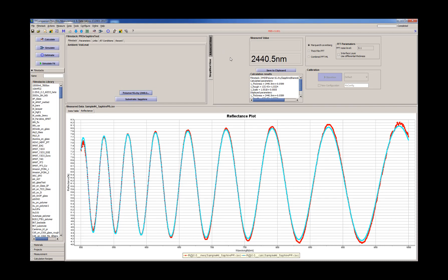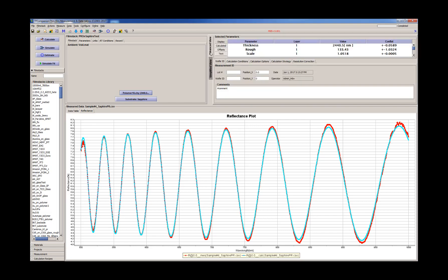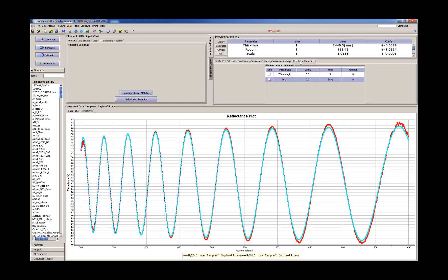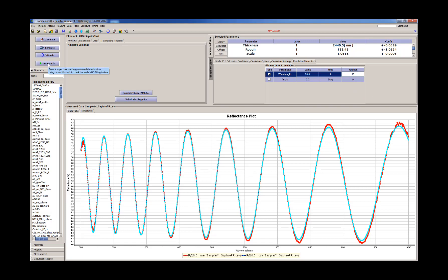So the last thing we wanted to check is resolution correction. So we're measuring with the wavelength resolution about 2 nanometers, 20 angstroms. We'll see what effect it has on our measurement results. Very small effect. So we have 2440.